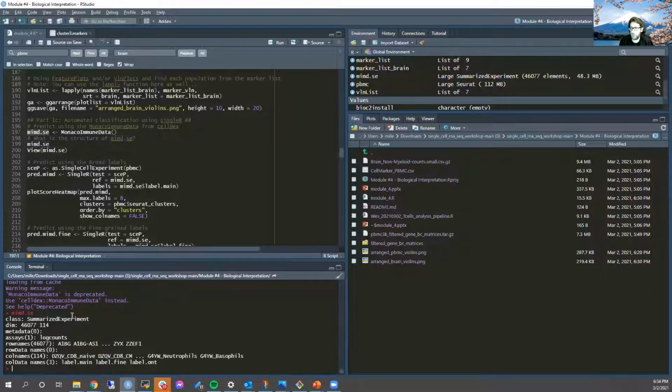As far as the features are concerned, you can see that it's actually quite similar to a scRNA-Seq object, but the main difference is that the things we're going to want to look for are not just the counts, which are in assays, just like they are in scRNA-Seq, but also the colData. In scRNA-Seq, that's called metadata. In SummarizedExperiments, it's called colData. So colData is the object which is describing your samples typically. So just so you know what that is.